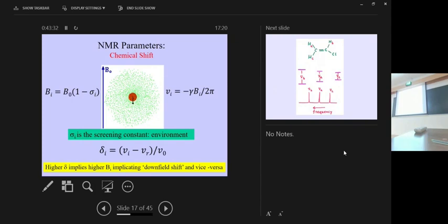All right, so that is so much for the NMR technique: the principle, the measurement, the conventional way of measurement. We'll come to the new way of measurement very soon. Now we look at the NMR spectrum. What is the information content in the NMR spectrum? What are the NMR parameters which are of significance for us?